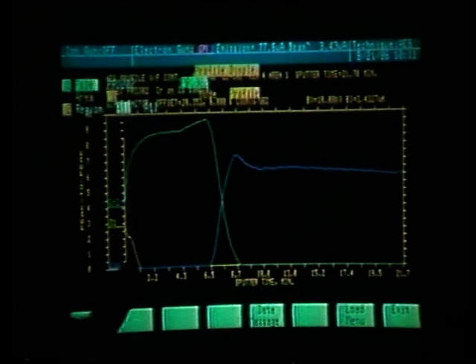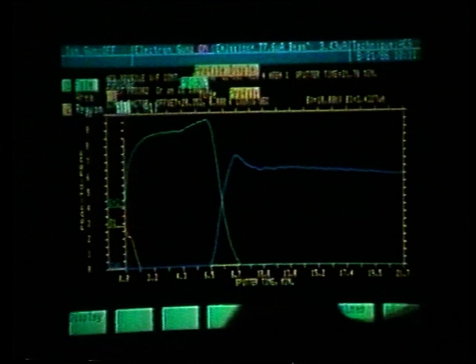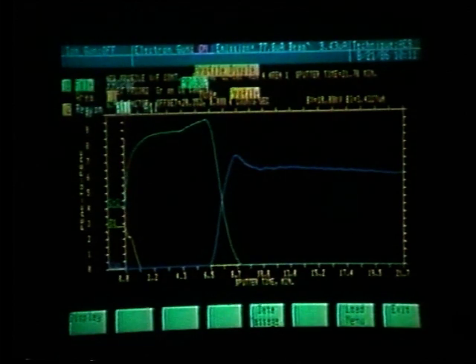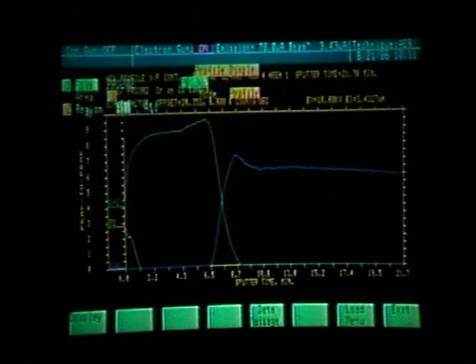Another point to make is we did this profile in the continuous profile mode. The time that it took to acquire this data was 21.7 minutes that we see at the bottom of the graph. In our window profile, the sputter time was the same, approximately 20 minutes, but the time that it took to acquire that data was much longer than 20 minutes.